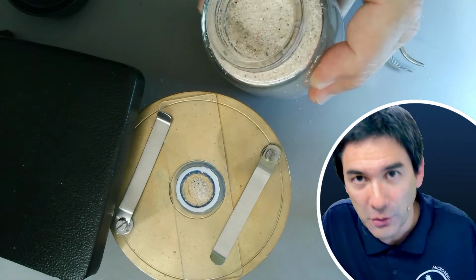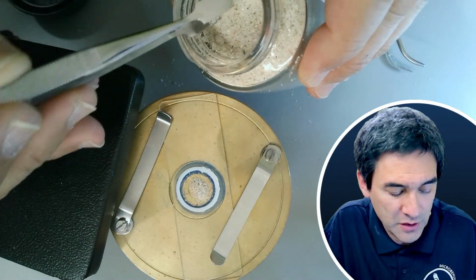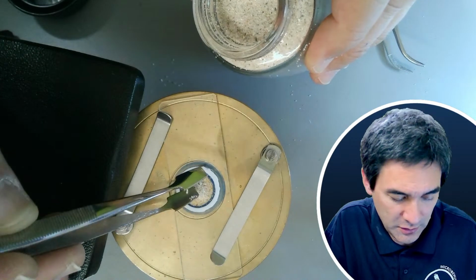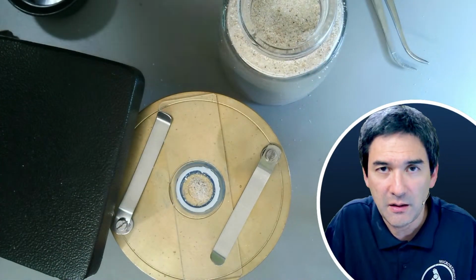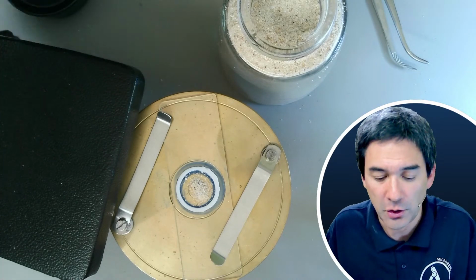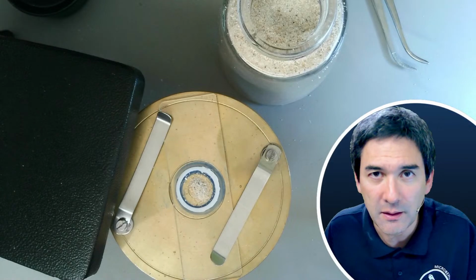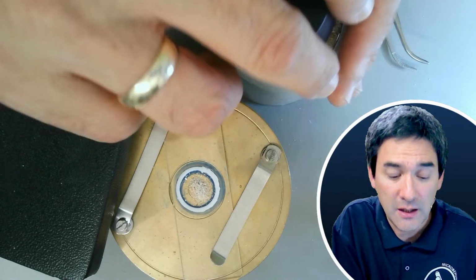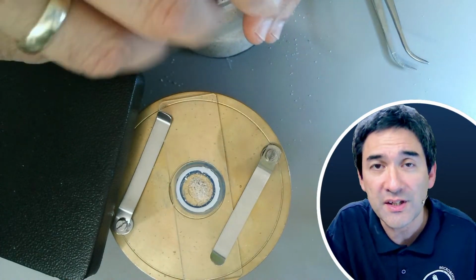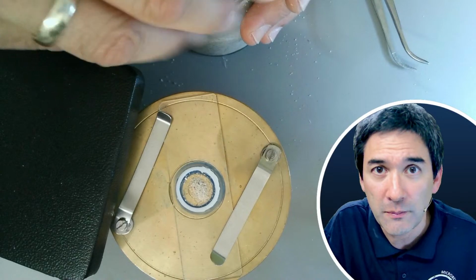I mean, a couple of years ago, before I had a 3D printer, I tried to use cardboard rings. I punched them out using a larger hole puncher with a hammer. But I found that the cardboard had significant disadvantages: it was absorbing all of the glue and the nail polish.